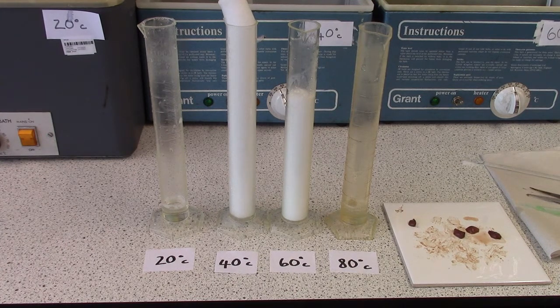20 degrees and 80 degrees — would that be expected experimental results? I am going to leave that one with you as a thought. Which temperature does the enzyme work best? Therefore, what has happened to the enzyme at 80 degrees and at 20 degrees?